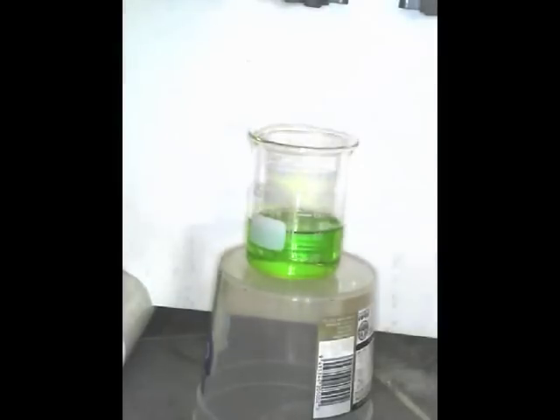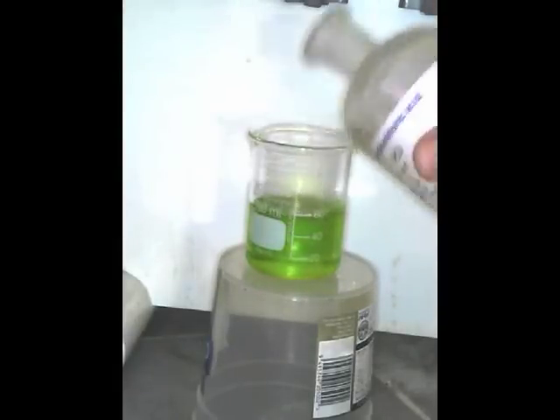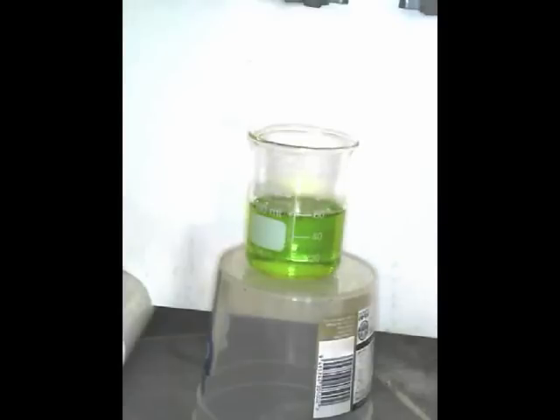So we've got that at equilibrium. If I add more chloride ions in this form — yes, I think that's going more yellow. Would you agree with that? Yep.